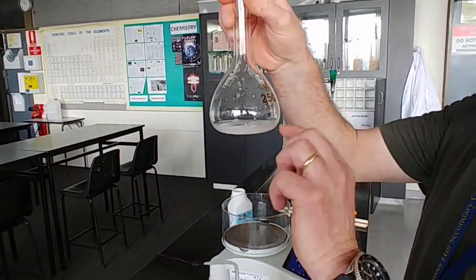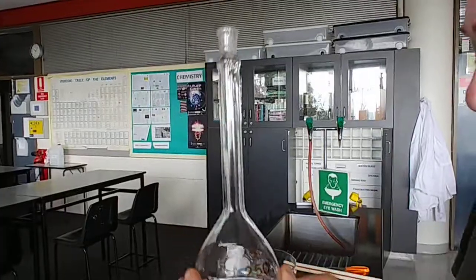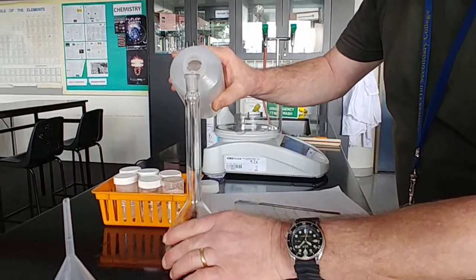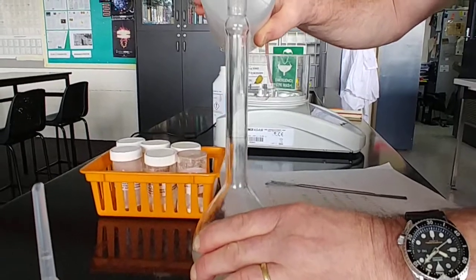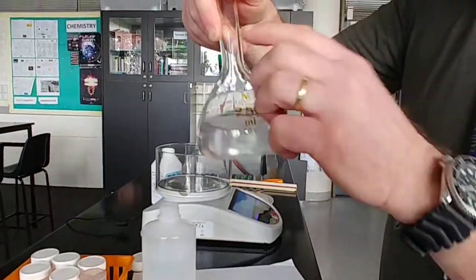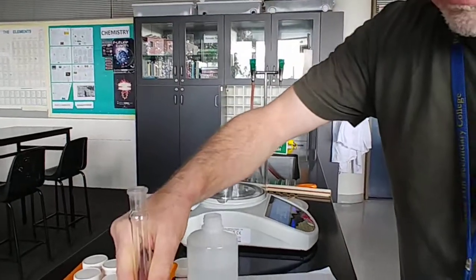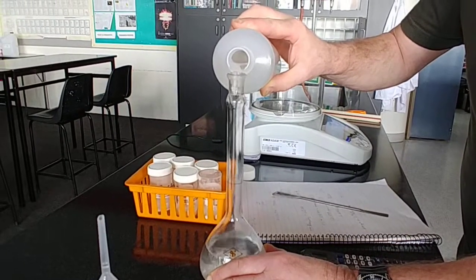Now we need to bring the volume of the distilled water up to the marker there, which is the volumetric mark of 250 ml. And take the squirt bottle off and we'll just bring it up pretty quickly in the beginning. Now you need to get it up there. One of the good practices is to get it up to about there and then swirl it. Because once you start filling it up, it's very hard to dissolve all that substance in there. Well, for our thing today, now that'll take a little while to dissolve, so for the purposes of preparation of this standard solution, we'll bring it up to the mark.